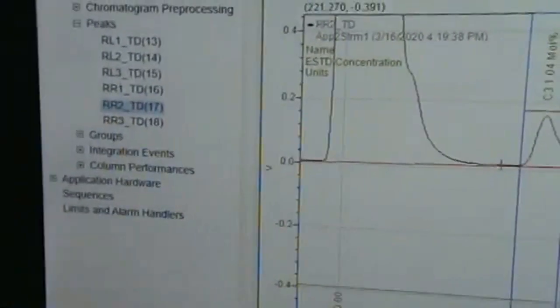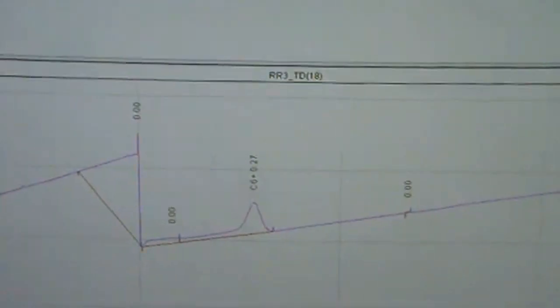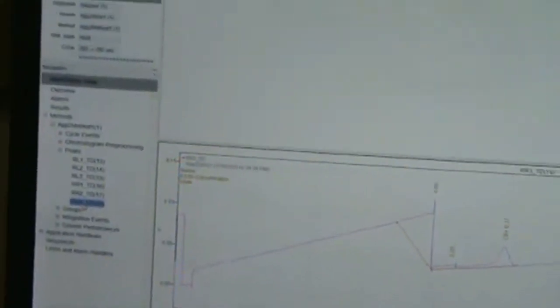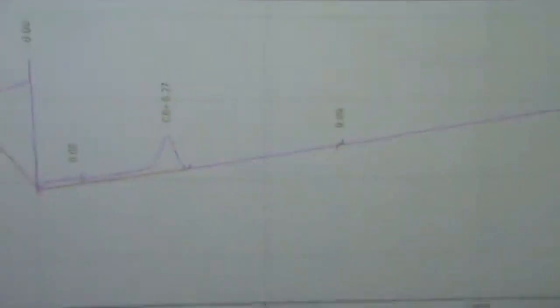C3s, C4s, C5s, we back flush C6, so let's go find her on a back flush detector. There she is. She's pretty. Look at her. But you can see how our baseline is all jacked up because she hasn't settled down into her temperature of 60 degrees yet. She needs a little bit more time to line out.